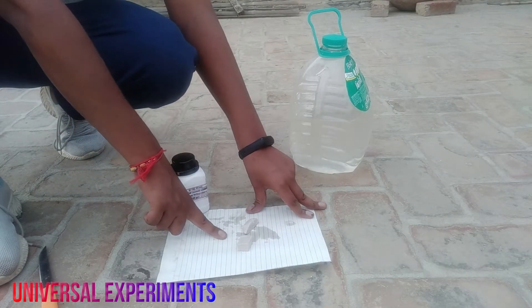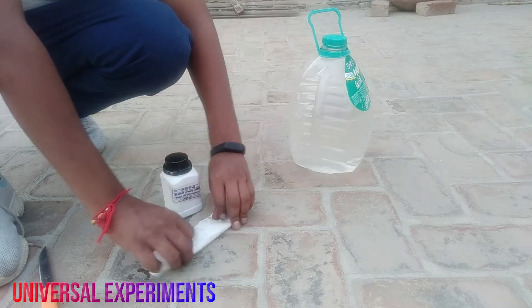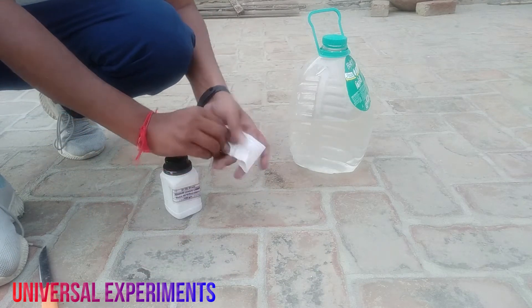Now we have released 2 sodium metal. Now let's wrap it up and put it in the bottle.